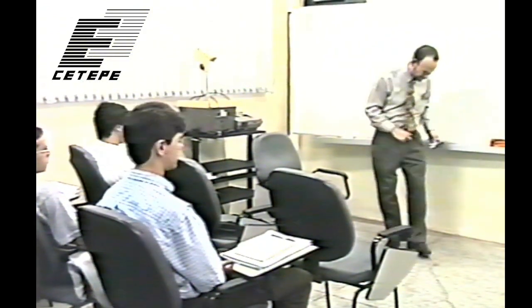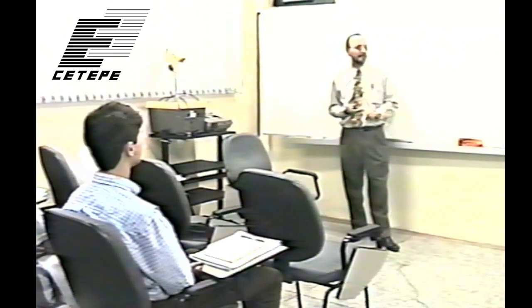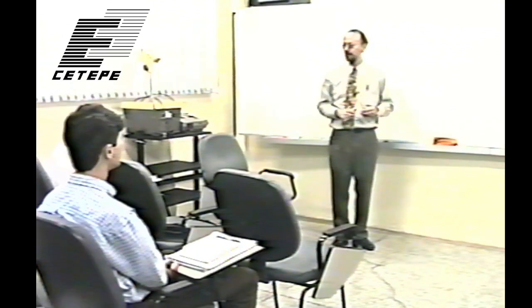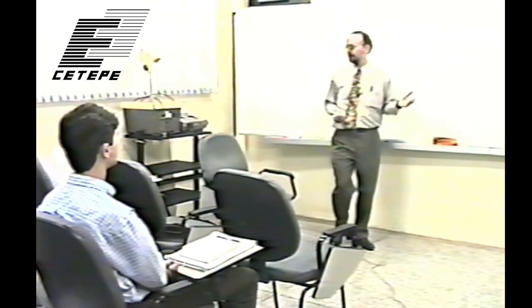Okay, so now, before talking about noise and some of the things in this handout, I wanted to say a little bit about detectors. X-ray sources, if you ignore the development of synchrotrons and laser-produced plasma sources, haven't changed much since Wilhelm Conrad Röntgen in 1895. All the X-ray sources have been based on this concept of blasting a target with electrons and getting Bremsstrahlung and characteristic radiation. So the sources are not really a very active front of research, except for a very few groups who have access to synchrotrons.